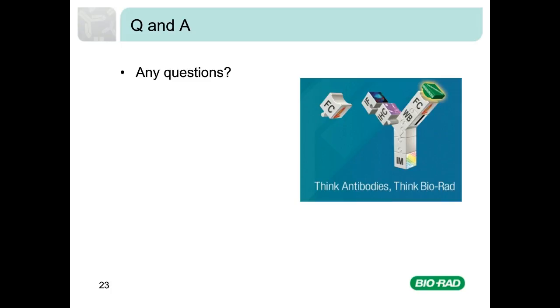The first question is, once I've set up compensation for a panel, can I use these values for future experiments? Well, strictly speaking, you should always perform compensation when a panel is run. Quite often it's tempting just to not do this step and use old values. And if your cytometer can self-calibrate at the start of every session to automatically adjust the internal voltages, this takes into account any change in laser performance over time, so you may actually be able to reuse a compensation matrix. We don't really recommend this for important data though, and there are a few caveats if you do this.